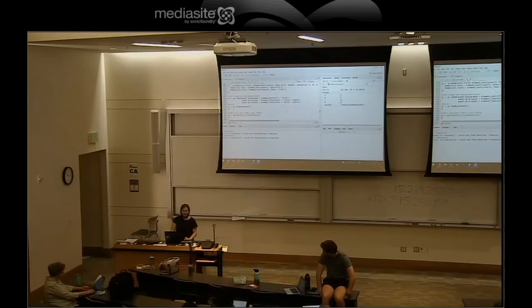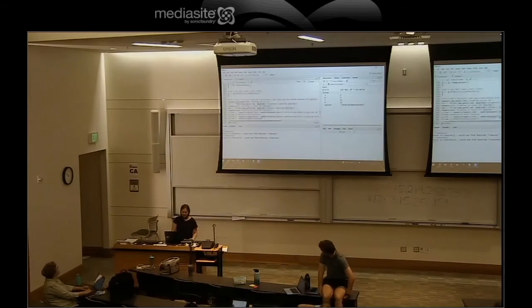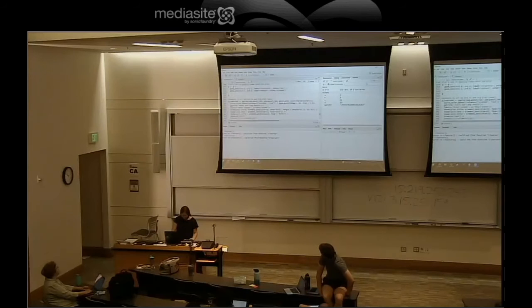G combined was just trying to show you that you don't have to have all your plotting in separate lines. It can all be together. SPECIES.